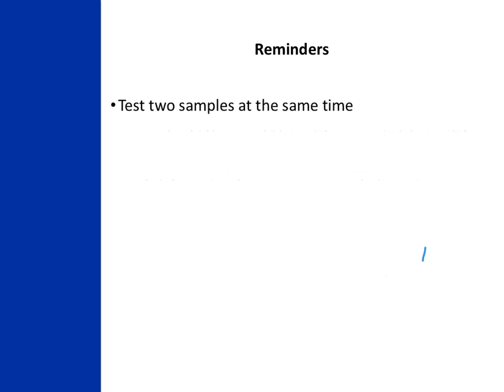Most importantly, we will be conducting this experiment on 2 different limestone samples to see how they compare. Because of the length of the experiment, you will need to test both samples at the same time. You cannot complete the lab with one sample and then go back and complete it with the second sample. There simply is not enough time.